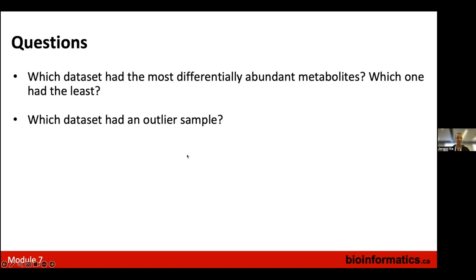The question about which dataset had an outlier sample ended up being a trick question — it had to do with the GC-MS data, which had a lot of missing values. Depending on which missing value imputation method you selected, and whether you auto-scaled when normalizing, you could see outliers in the PCA. That's normal with missing values, because different approaches make different assumptions. Auto-scaling can really impact whether a few metabolites heavily influence the PCA scores plot. The outlier wasn't really real — it was created by the data analysis choices, which is why it's important to look at the PCA plot.